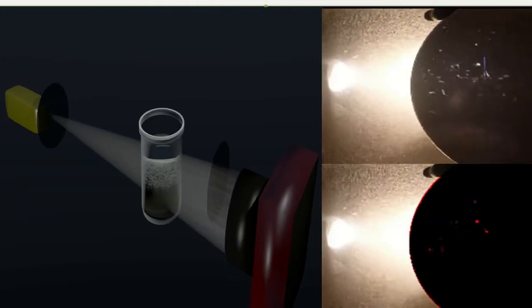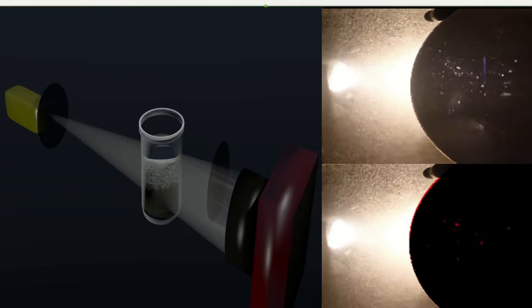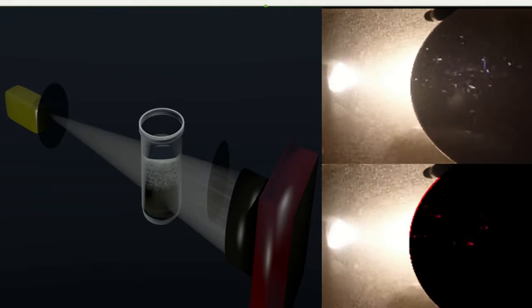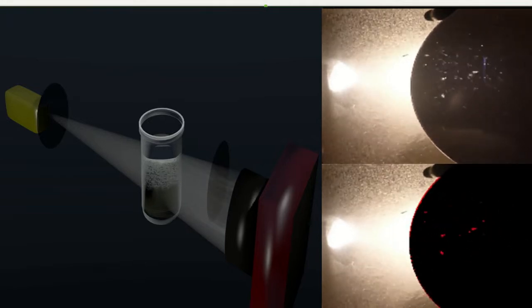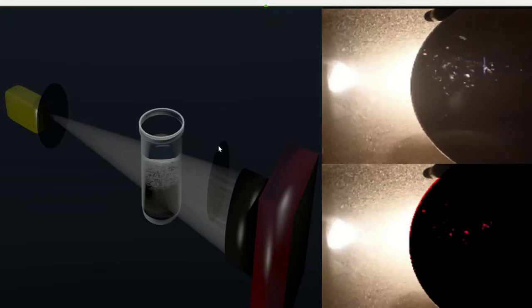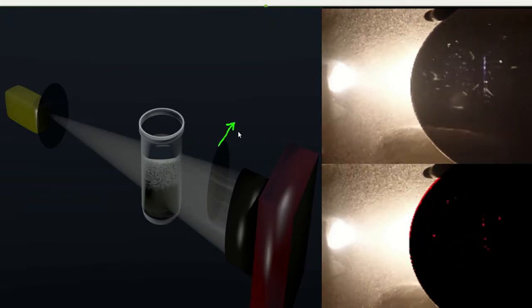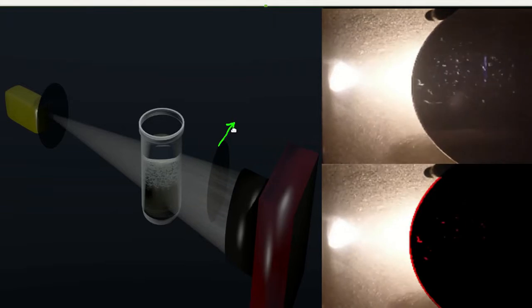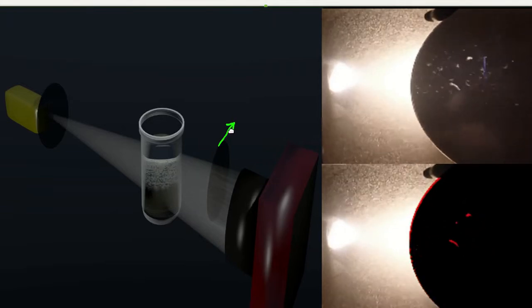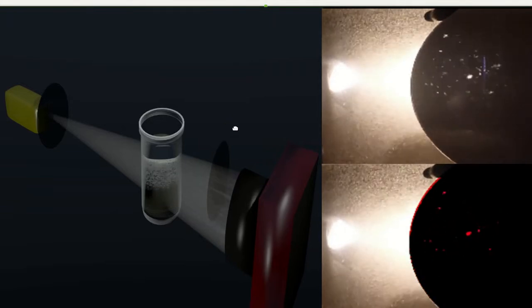The following further illustrates the viability of using the birefringence of the API particles to measure dissolution. The setup is very similar to the previous setup, the only difference being the analyzer has been offset to the right so that only part of the light passes through the analyzer.